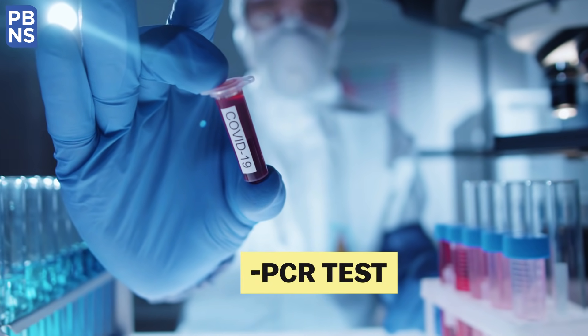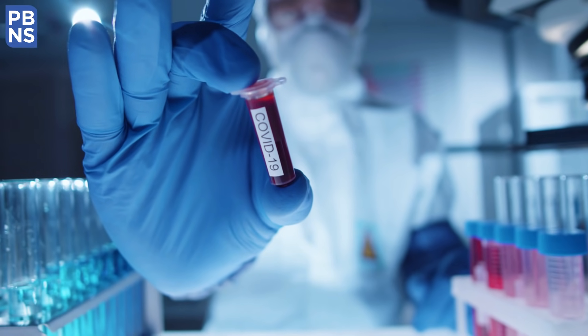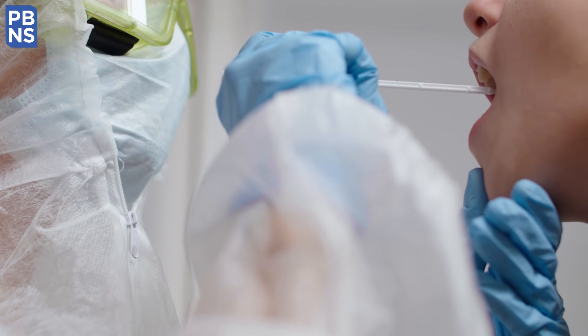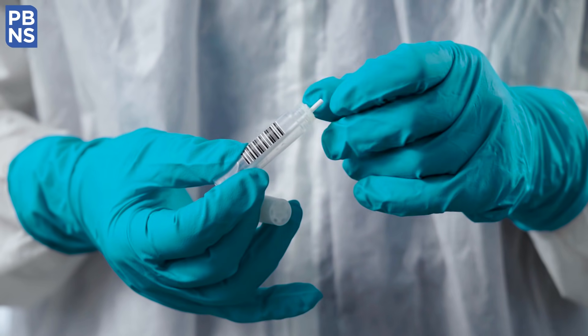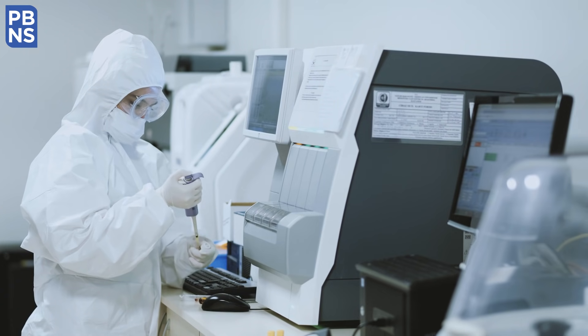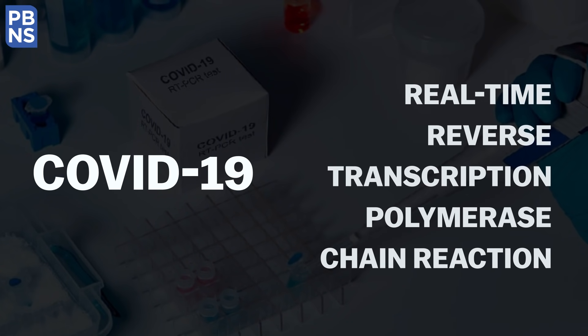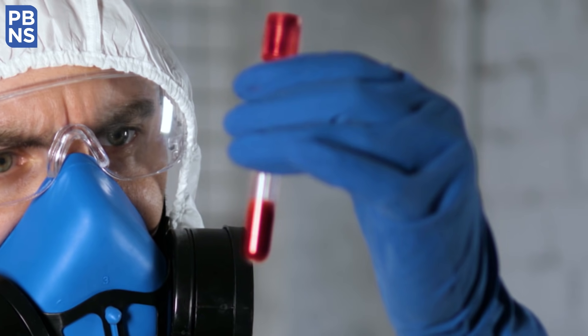How does the RT-PCR test of coronavirus work? There is a lot of curiosity amongst people regarding the testing of coronavirus. Today, we will learn about the most accepted test, RT-PCR, known as Real-Time Reverse Transcription Polymerase Chain Reaction.